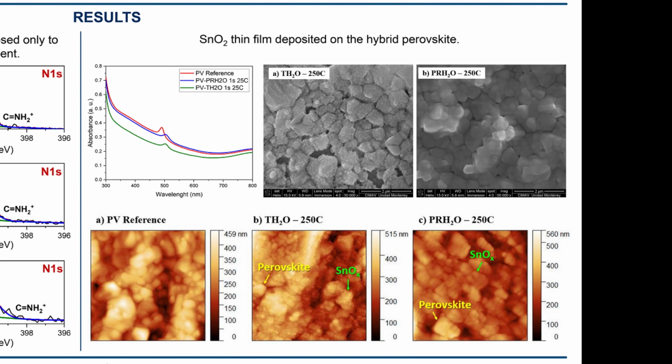In the SEM micrographs, it is observed that there is a decoration of the perovskite crystals when using thermal ALD of water. When it is used in remote plasma, such decoration is not evident, but the presence of crystals does exist. What has been said above is confirmed with the AFM micrographs, where it is observed with greater contrast how the naturally existing holes in the perovskite are being filled by the new tin dioxide crystals.